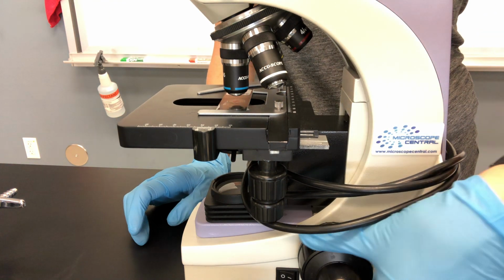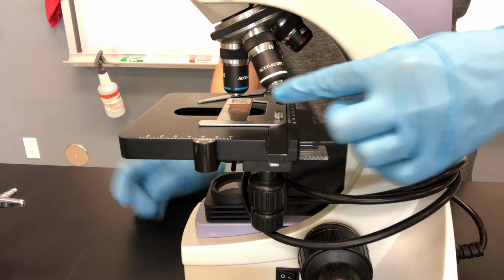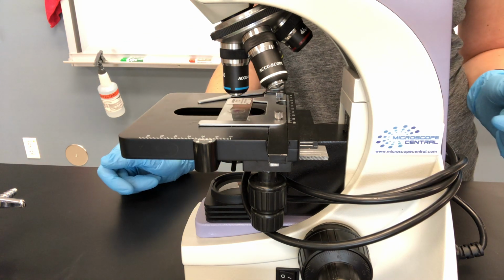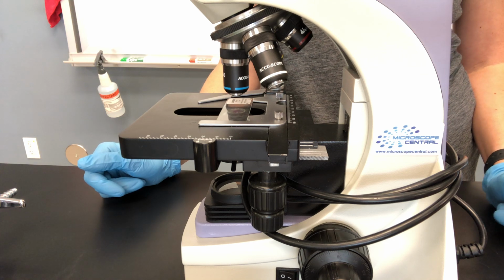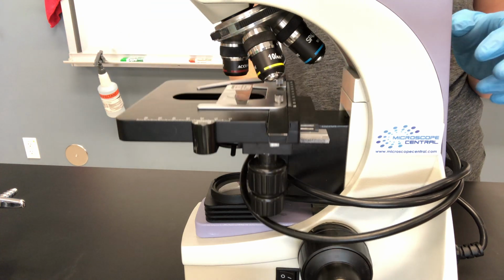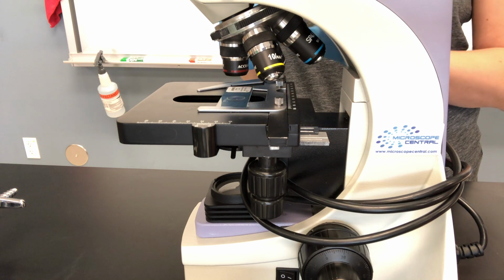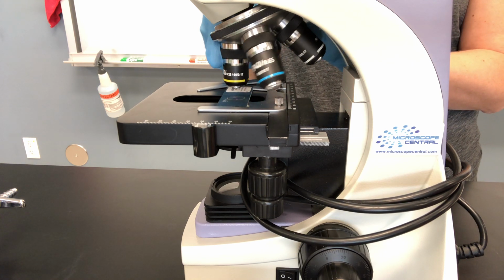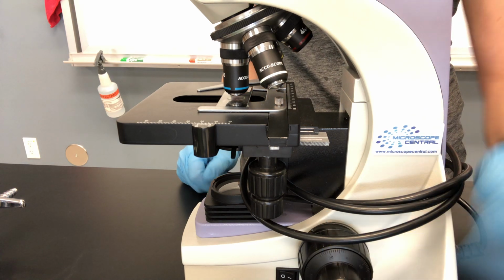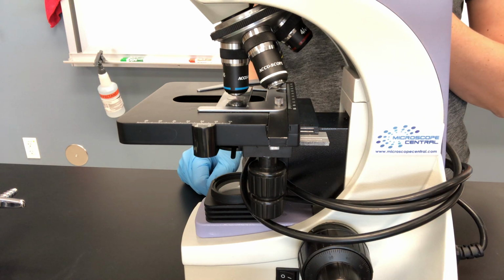So if I walk around and I see somebody with this much space in between their slide and this high power, I know that you're not seeing anything because that's not how the high power works. So I'm going to get things back like this. Scanning, low, high power, fine focus. Now we're ready to try to go up into oil, okay?